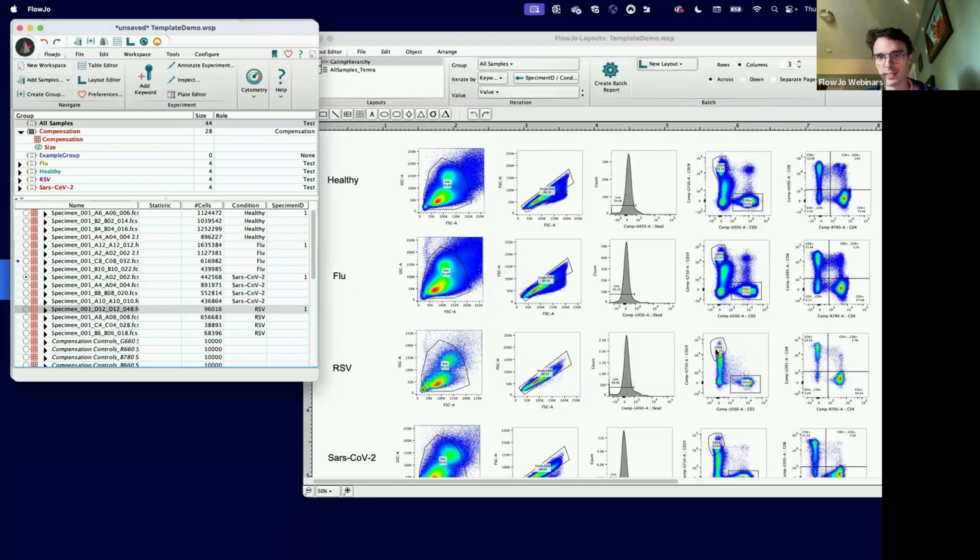Okay, so I'm going to press OK here. It's going to change nothing because I have the same samples chosen. But if I wanted to change things up, I can maybe assign specimen IDs to each of these other samples. I'm just doing it in order, but I could mix the order up. I mean, just for fun, let's do that. So I'm going to go 4, 3, 2 with this last one.